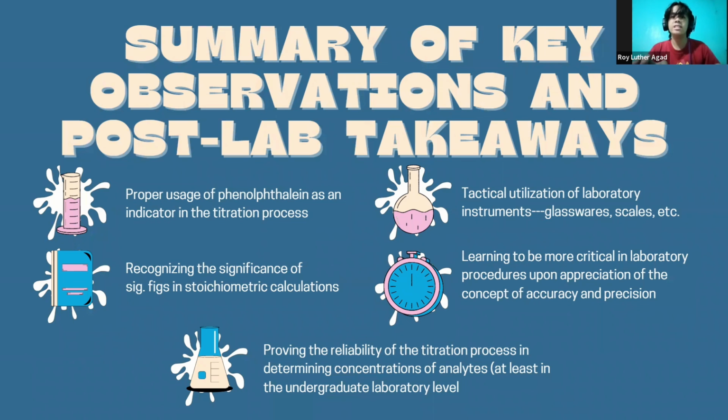In a relative sense, we also bear witness to the effectivity and reliability of the titration process in determining concentrations of analytes, at least at the undergraduate laboratory level, judging on its procedural structure, which we performed ourselves.